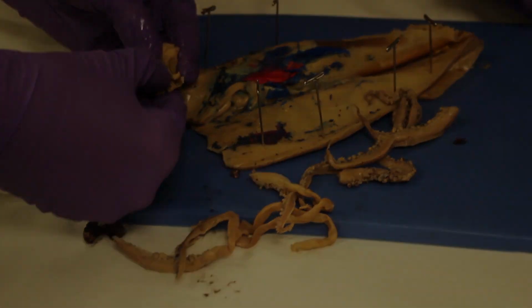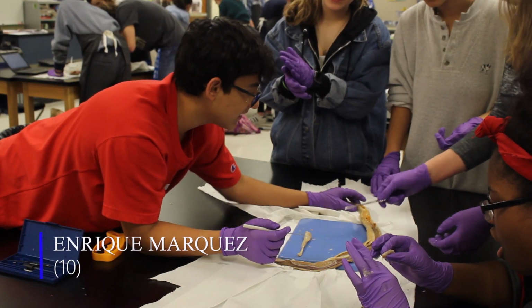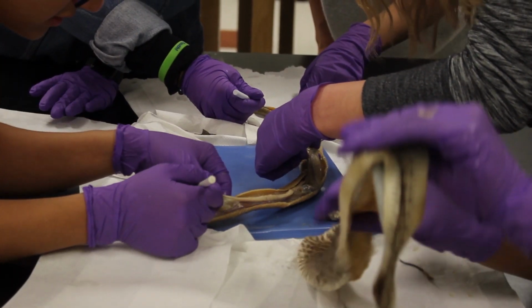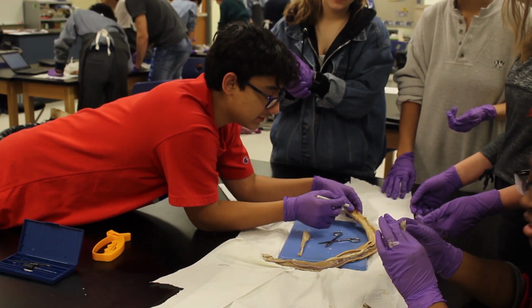This is a squid, right? Yep. We are dissecting a rattlesnake, and the point of the lab is to find the animal's internal organs.